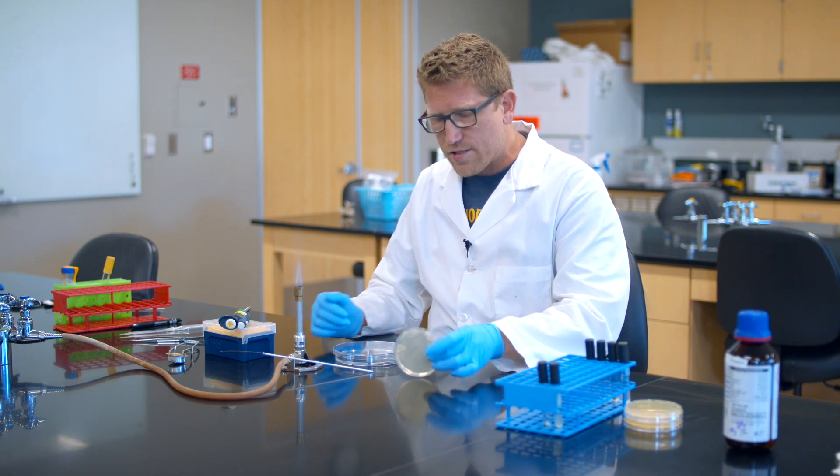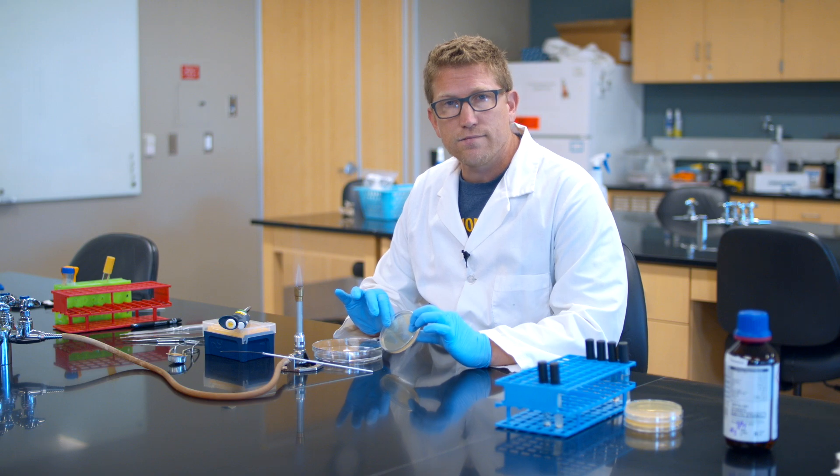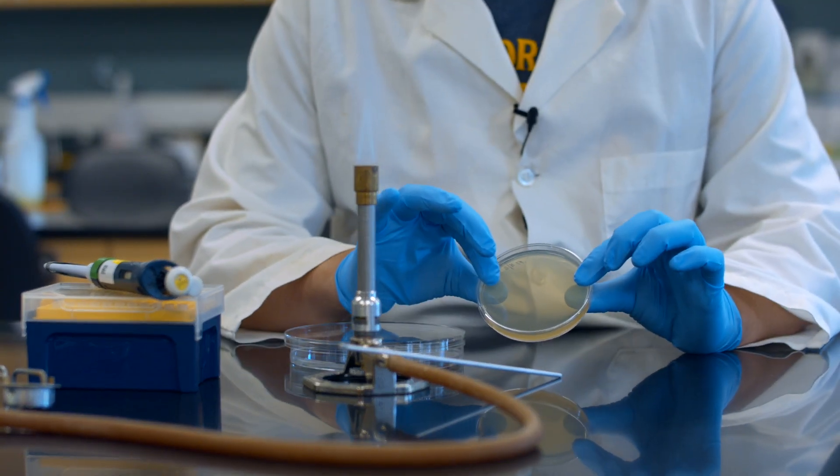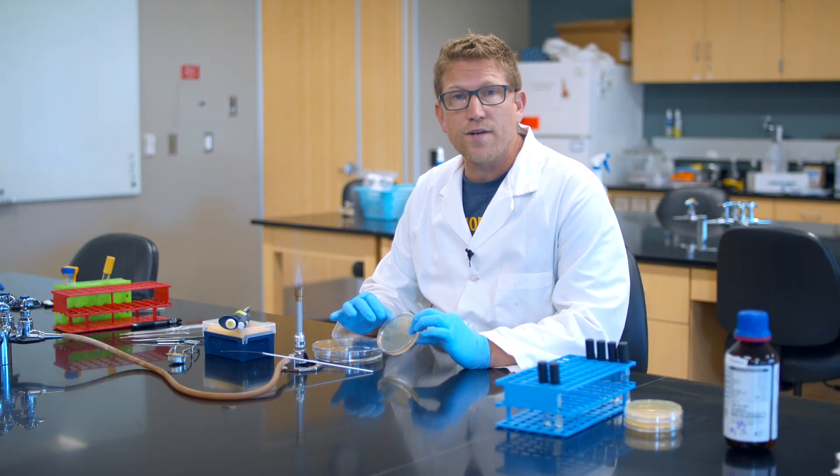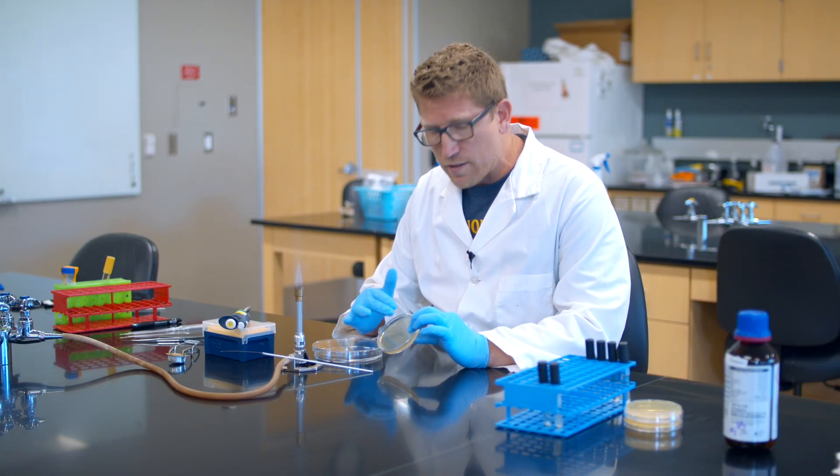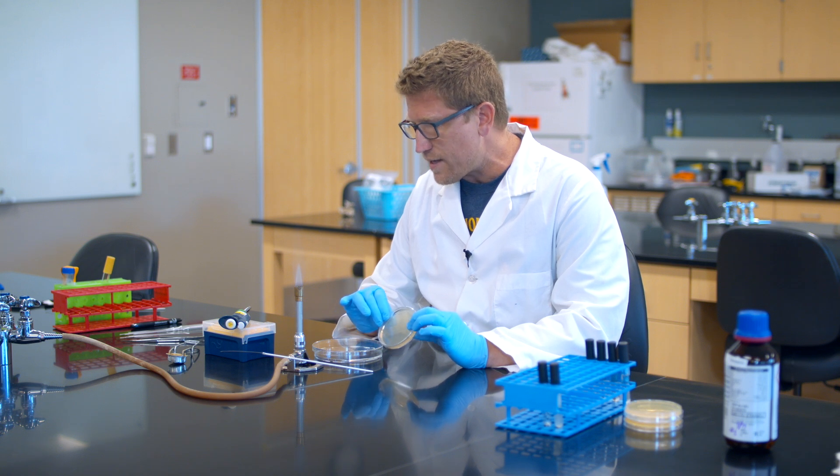So what I've got is a sterile petri dish, LB agar. This is a nutrient recipe that the bacteria like that encourages their growth with a solidifying agent agar in it and we should be able to get colony growth on the surface of this.